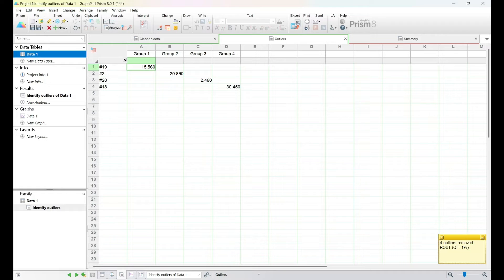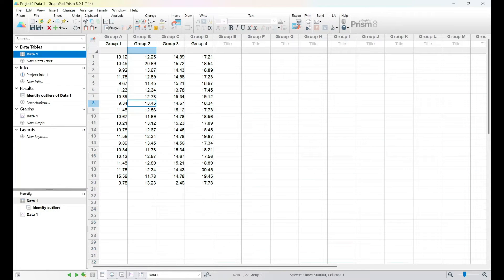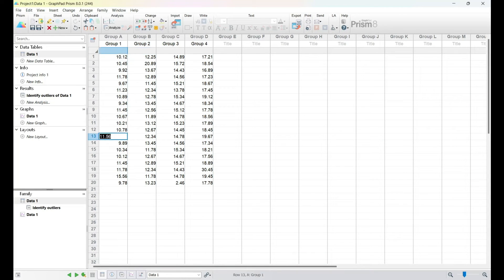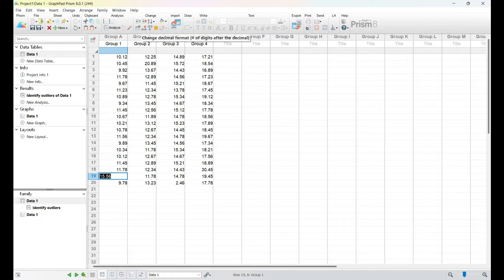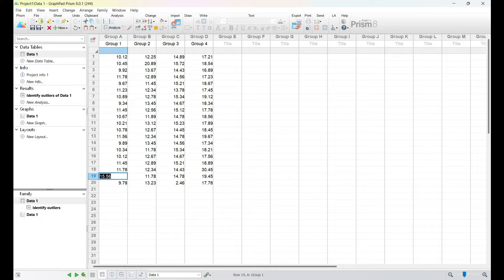Once we've identified and potentially removed outliers, we'll discuss how to update our data set in GraphPad Prism. It's essential to document any changes made to the data to maintain transparency and reproducibility. Outlier checking is not just about data cleaning, but also about ensuring the reliability of our analysis.